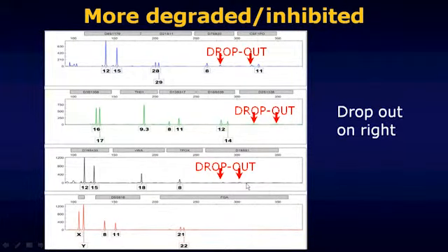That's locus dropout. Here's another instance of locus dropout, but here we can tell because we know what the underlying DNA contained, but these are instances of allelic dropout. One allele remains. If we didn't have a reference sample to compare to, we might mistakenly come away saying that the contributor to this sample at the D7 locus was an 8-8, whereas we know from our other tests that because of the degradation there was another allele that simply failed to be detected after degradation or inhibition had taken place.